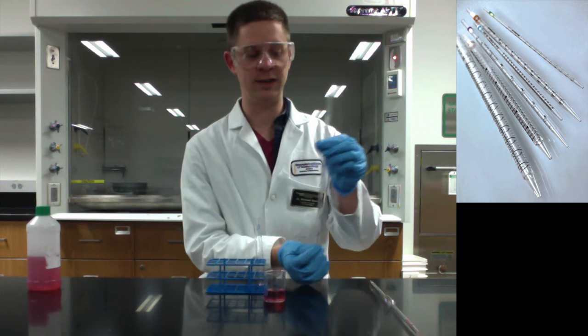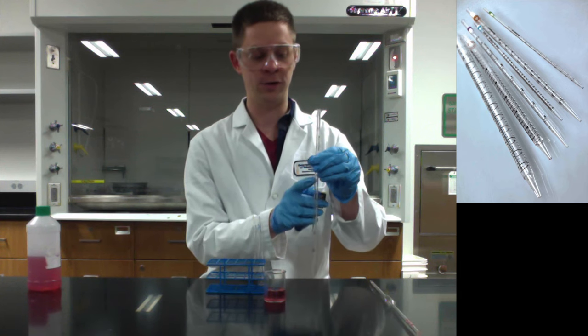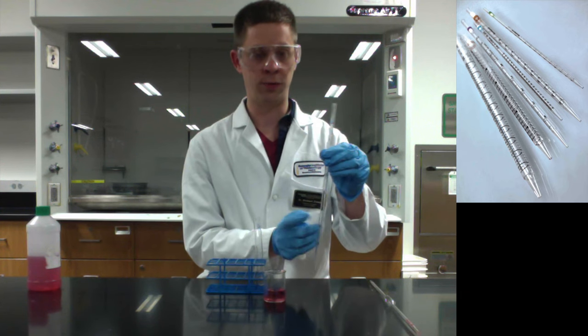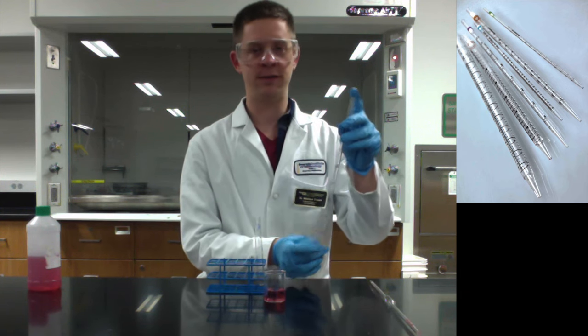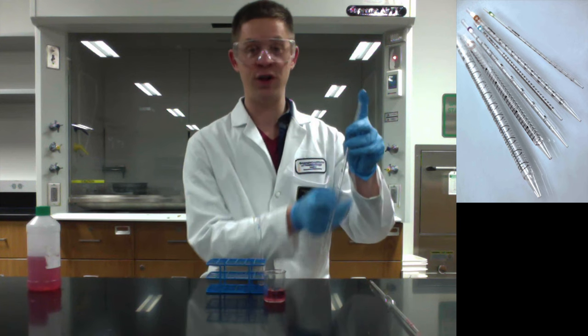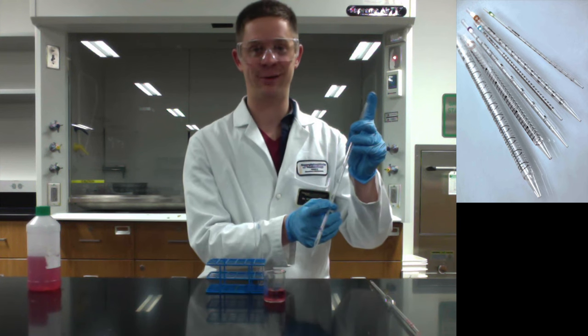You'll notice that the scale actually increases as you go down. Zero here, one, two, three, etc. That's because this device is meant to be used in a fill first and then deliver type manner.